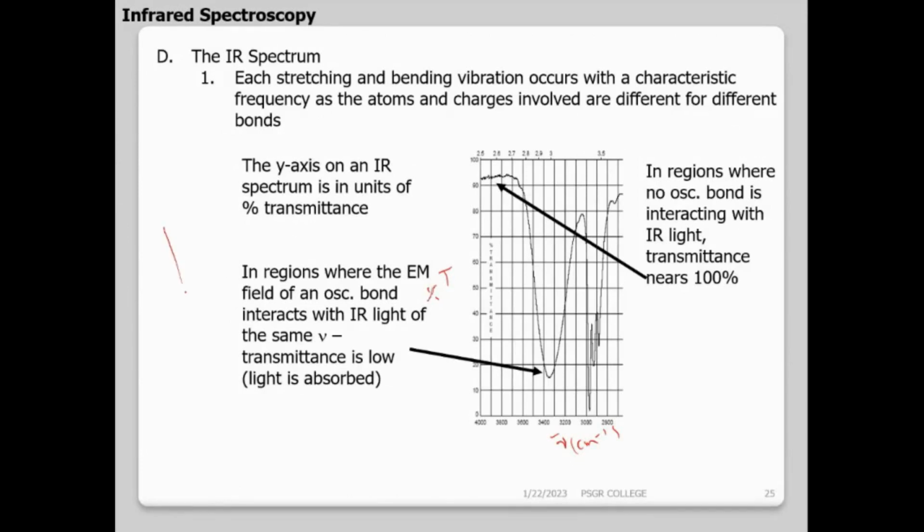You would have studied in UV, in UV you have lambda max. So you have lambda versus the optical density, and you'll have a curve like this. Okay, so intensity will be higher here, and here you have low intensity. So this is absorption. Okay, 100% absorbance means a strong peak, 0% absorbance means a low, weak peak.